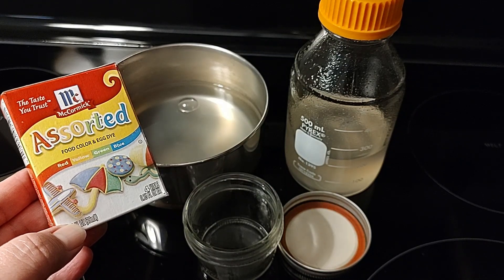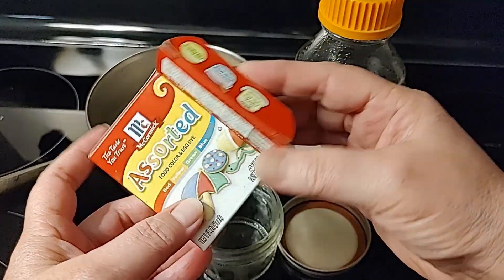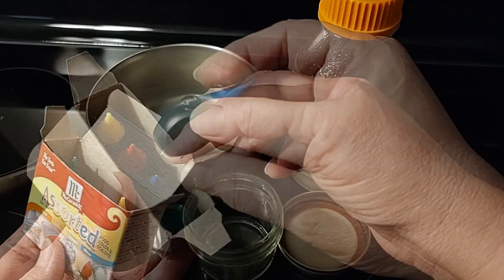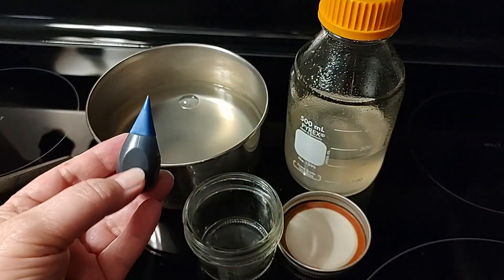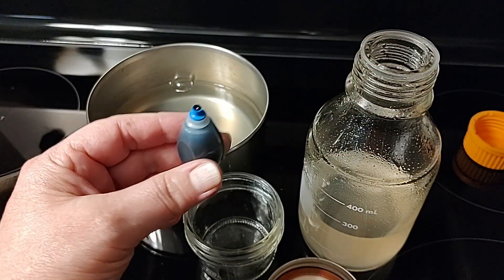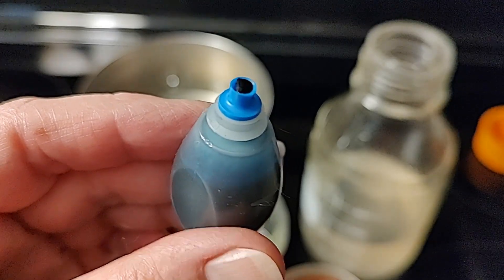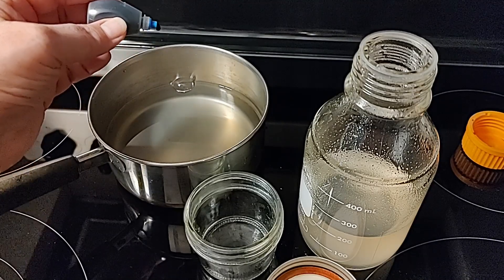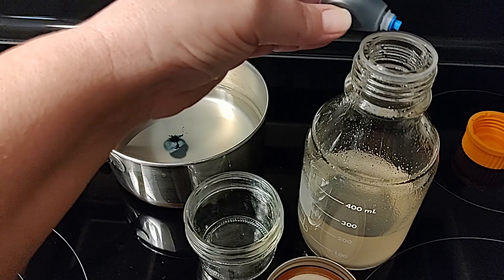Welcome back to Mycology Exploration. In this video, we're going to be talking about agar and color. Why do people add food coloring to their agar? I think there are two reasons. All you need is one drop — just add one drop of food coloring to your agar recipe as it's cooling and before you put it in the pressure cooker.